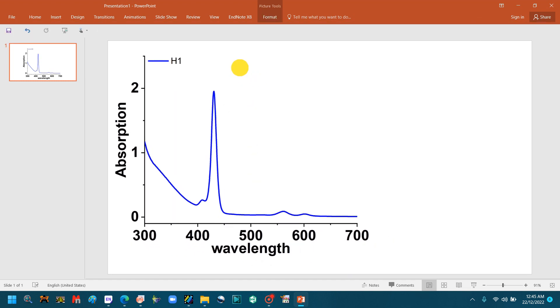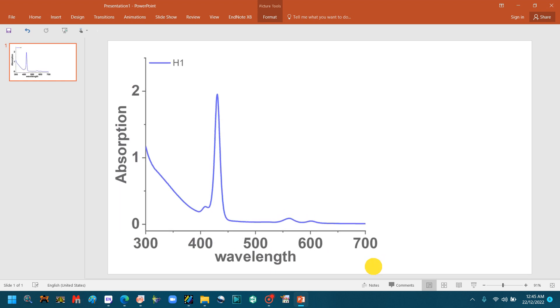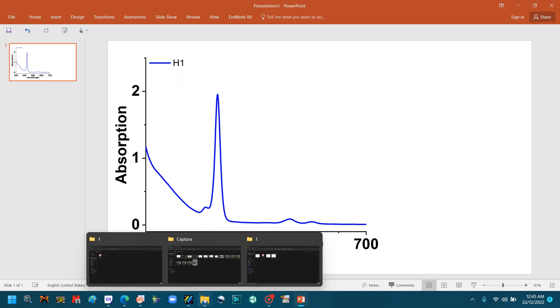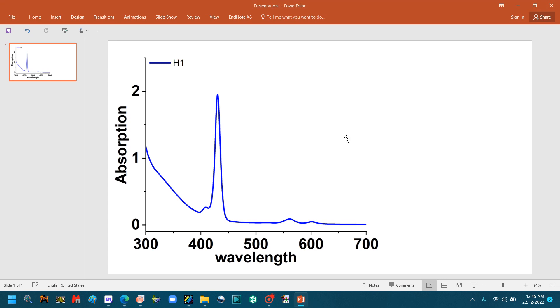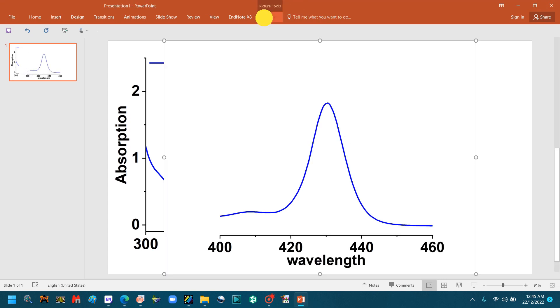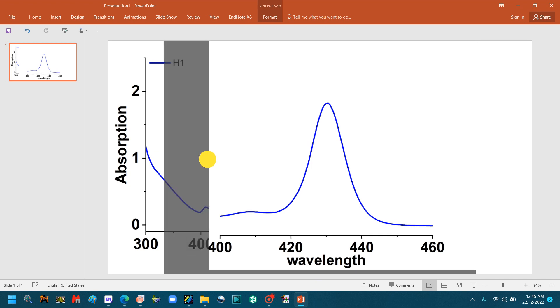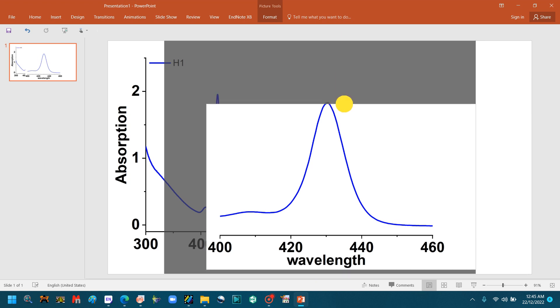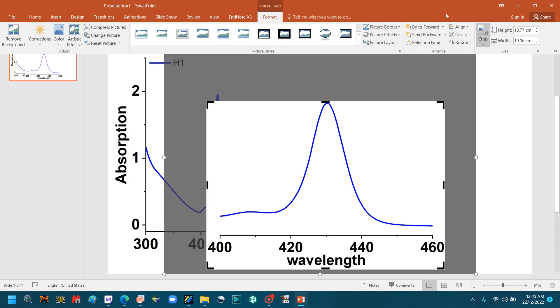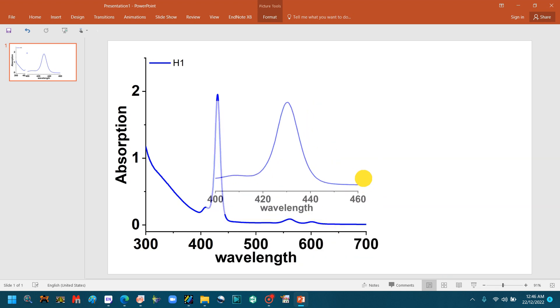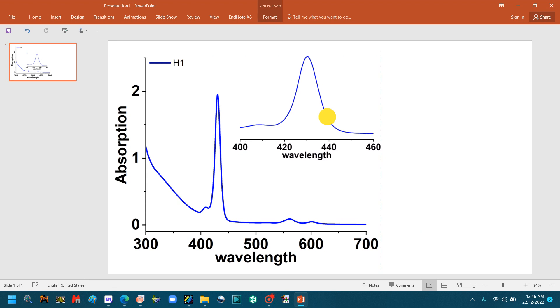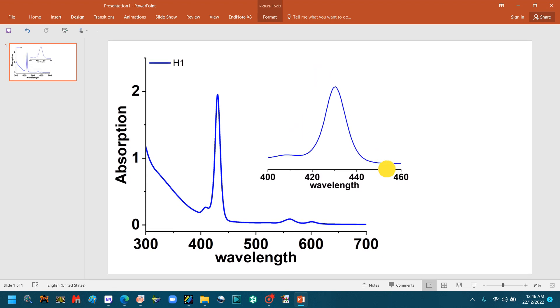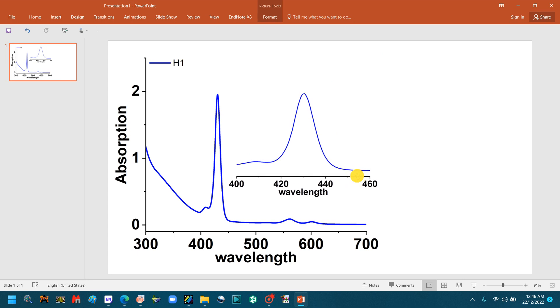Go to Format again, click Crop, and your image will be cropped. First, set the position of the main graph. Now select the zoom file, Ctrl+C to copy. Go to PowerPoint and Ctrl+V to paste it. Again crop the excess part of this graph.